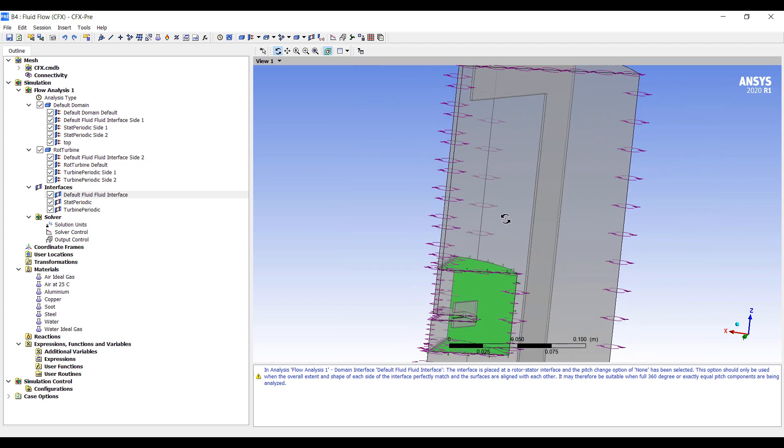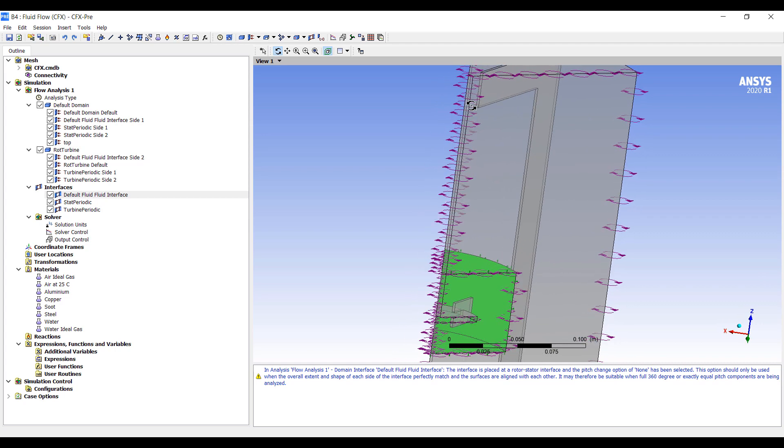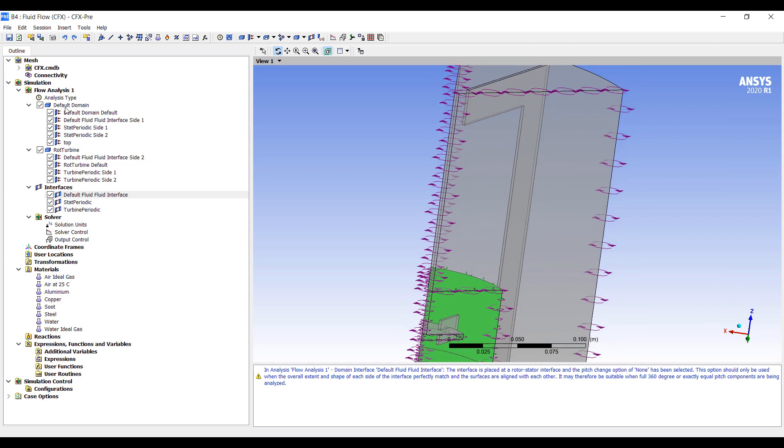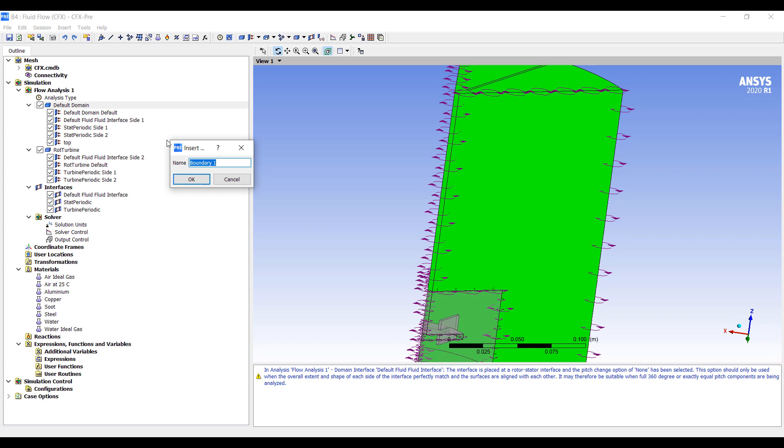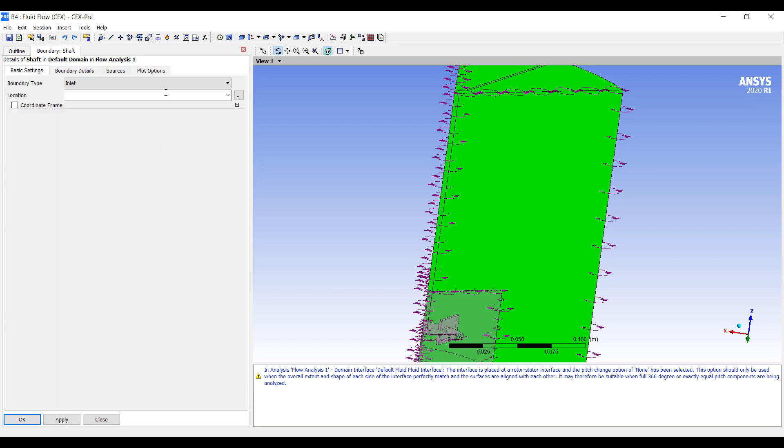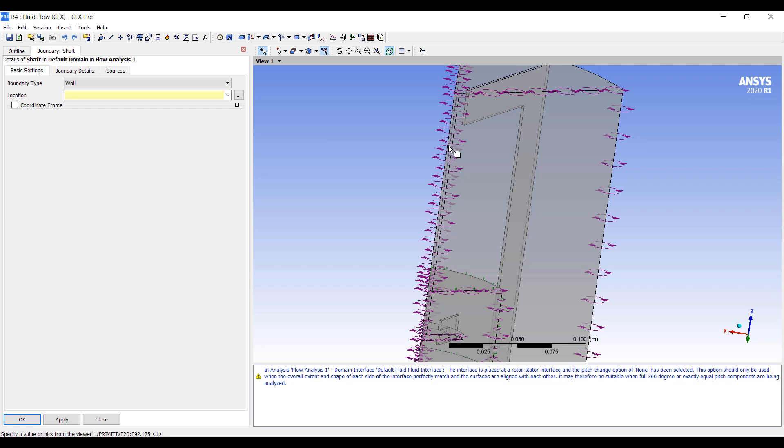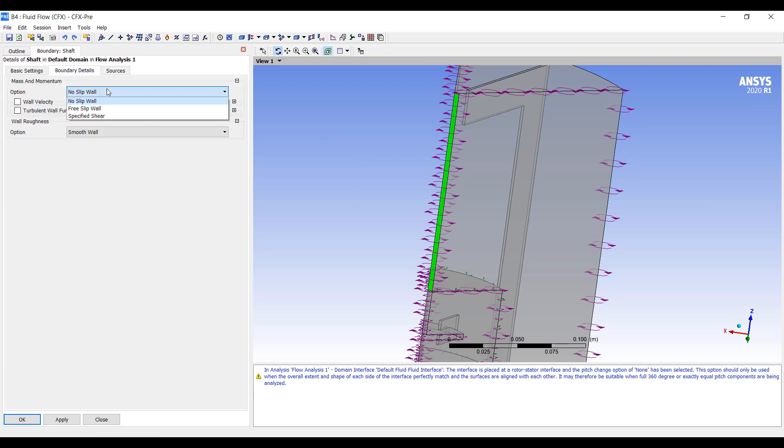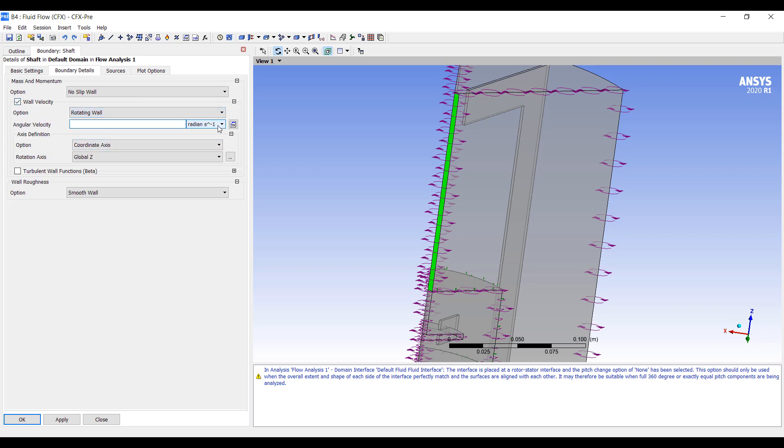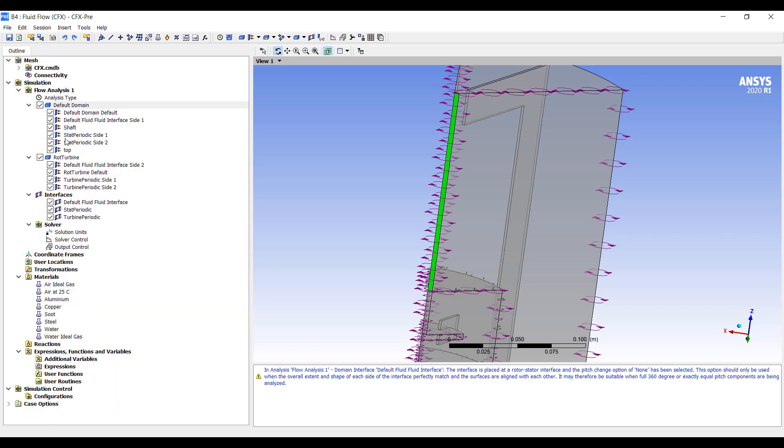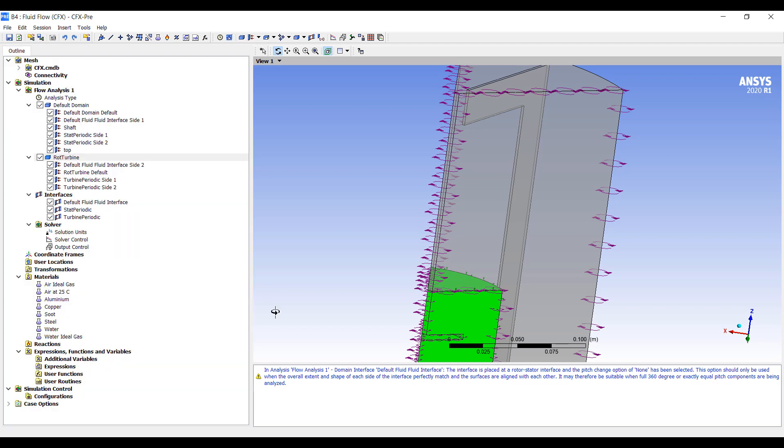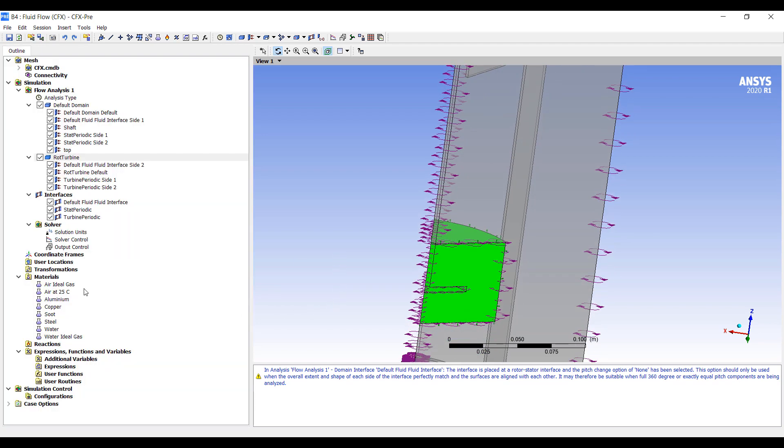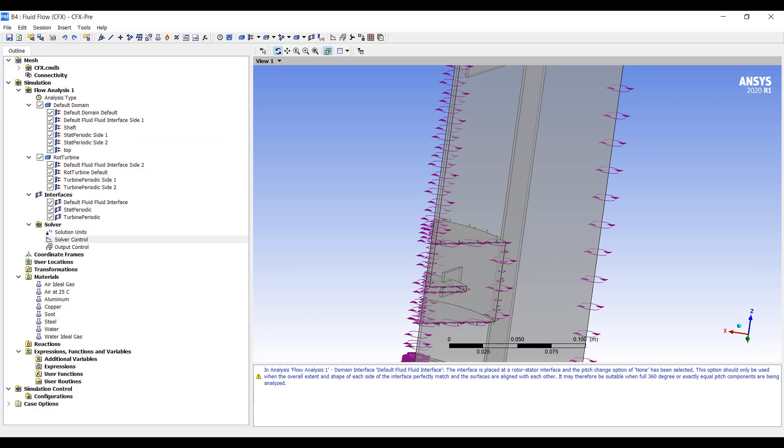And I guess we should specify a rotation boundary for the shaft as well. So let's do shaft. This will be a wall. And this is a shaft here. So this will have a wall velocity, rotating wall, angular velocity, 340 revolutions per minute around the global Z. Just double checking to make sure this is the same rotational speed we set here. Then everything makes sense. So that's all we need to do for the simulation. Now we just have to specify that we want to run this for a little bit longer than usual. And off we go.